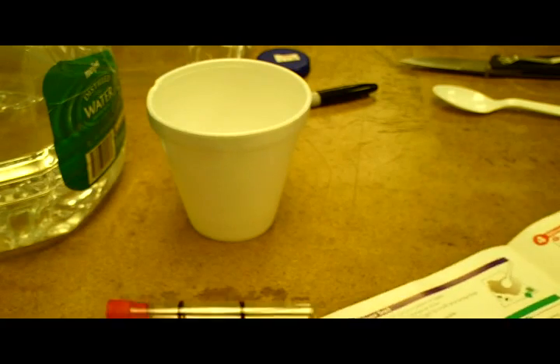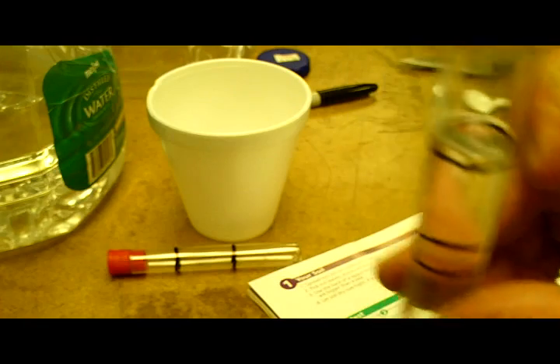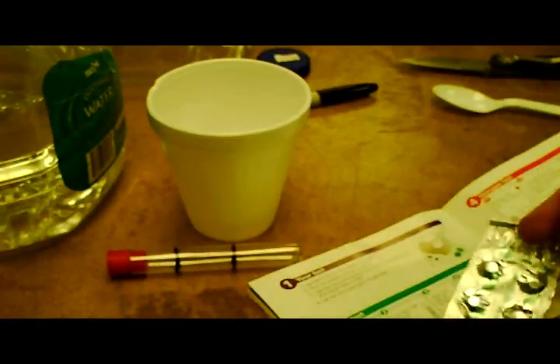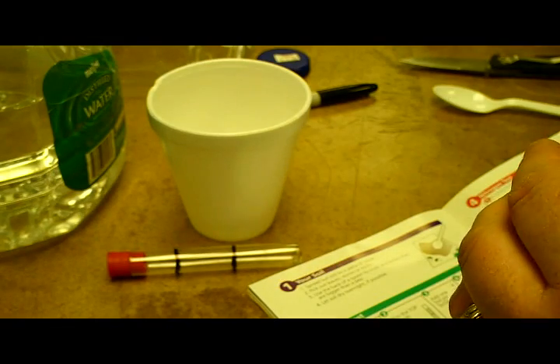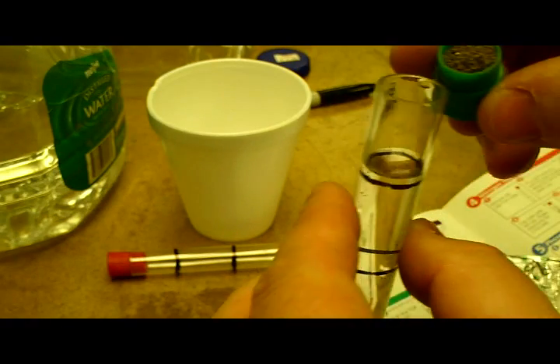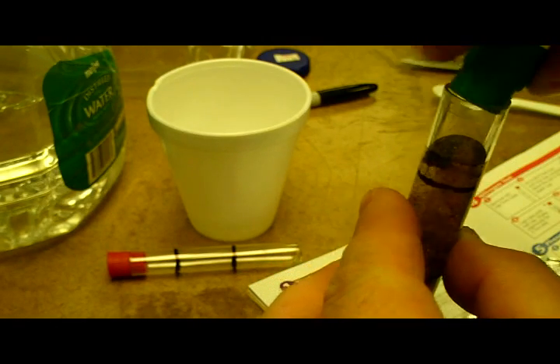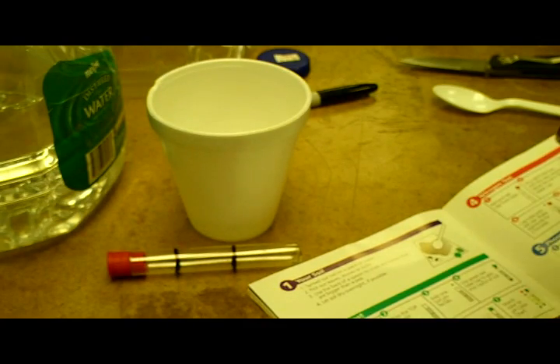The soil pH instructions are to fill the test tube to the top line with distilled water, which we've done. Take one green pH testing tab and put it in there. Then take the green cap, fill it with one sample of soil, and put it into the tube.